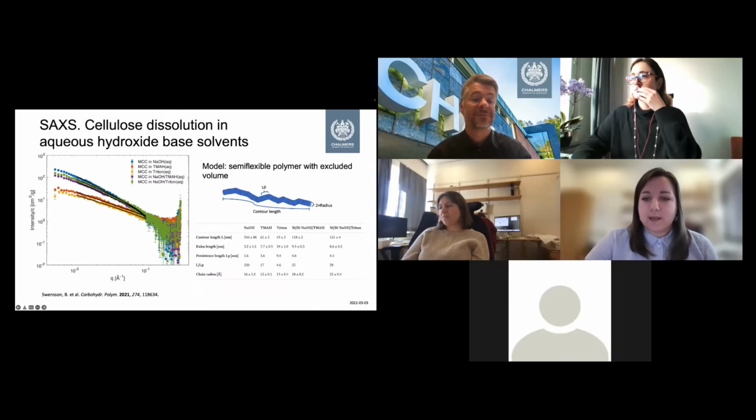With this, they could see that in some of the solvents, the polymer chain is more stiff and more aggregated as compared to other solvents where dissolution is more preferred and the polymer chain is more flexible.